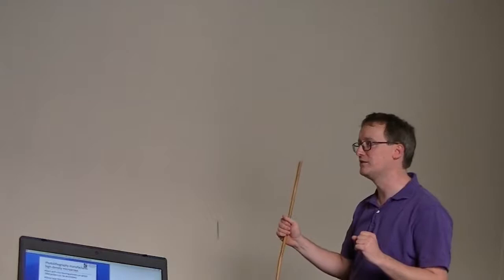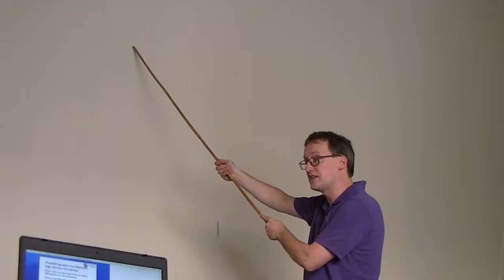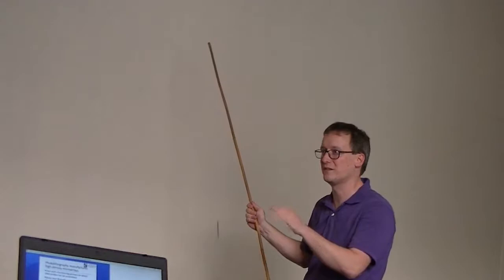Now, I add a big glob of A to this surface. And any place that's been exposed by blowing away the mask, we add another nucleotide. Good so far? Now, I paint a mask over it all again. Now I'm going to add a C. The next letter I want for probe one is not a C, it's a T, so I'm not going to shoot here. But the second probe is going to start with C, so I do etch here. The second letter I'm going to add to spot three does have a C as the next letter, so I shoot at that. So now I have spot one covered by mask, spots two and three not covered by mask. Now I add a big glob of C to that surface, and the C sticks onto spots two and three.